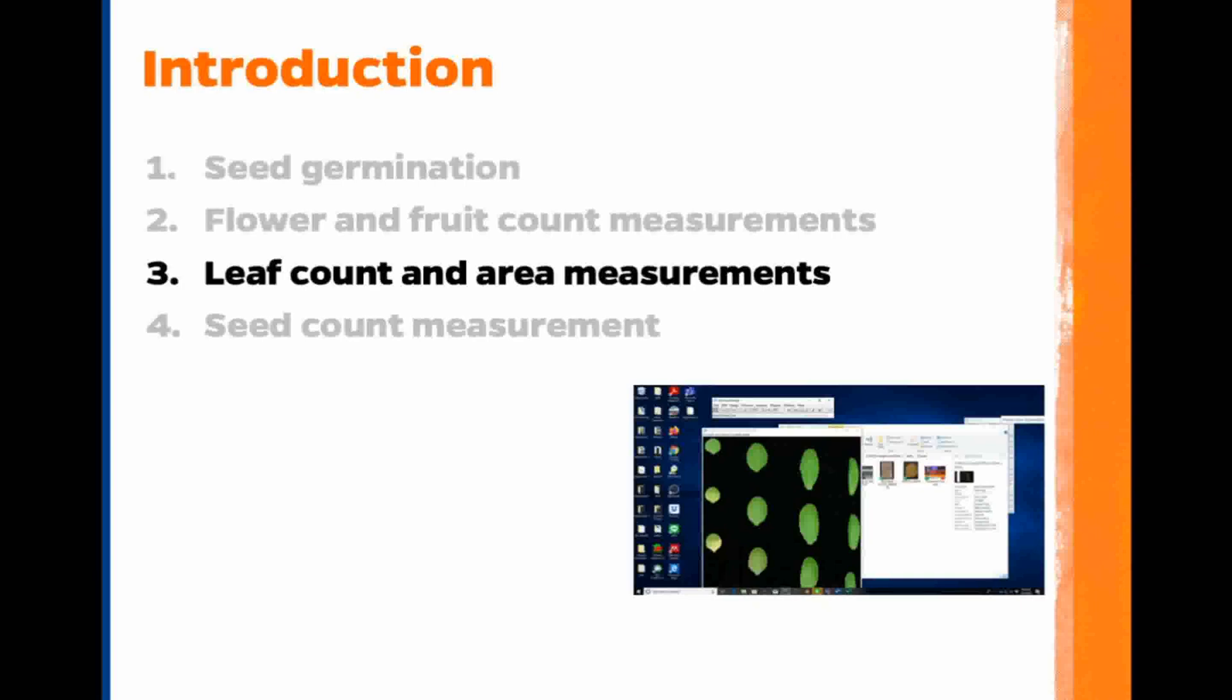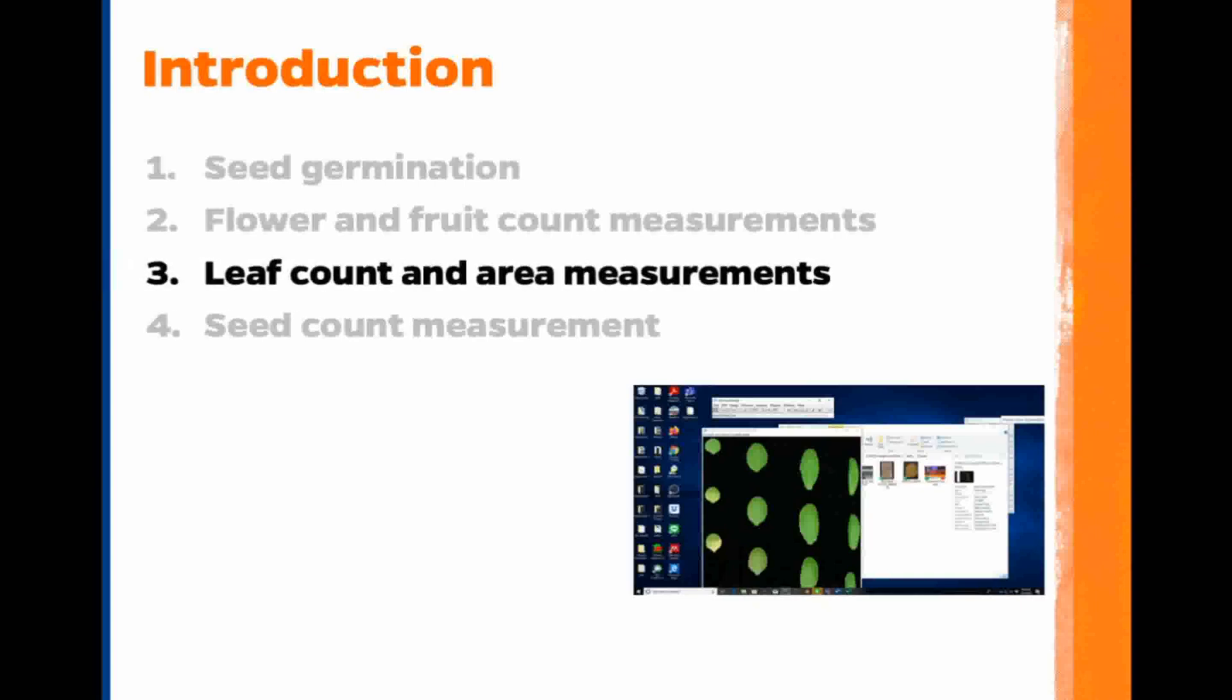This is the third video in a tutorial mini-series about counting with ImageJ. In this video, we will automatically count Arabidopsis leaves and measure the area for each leaf.